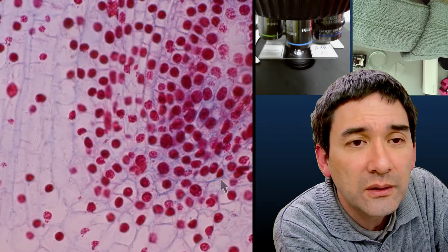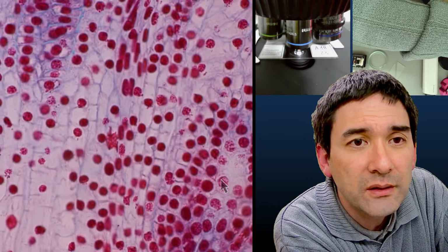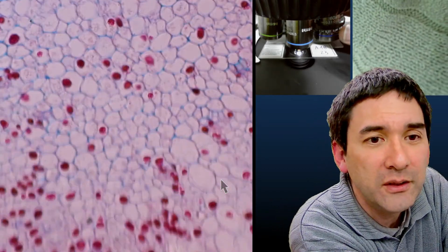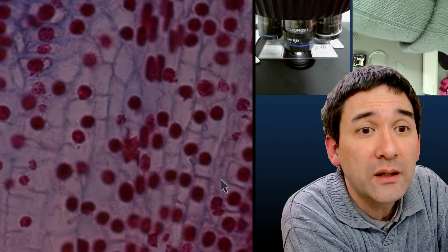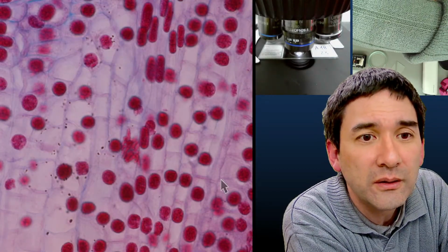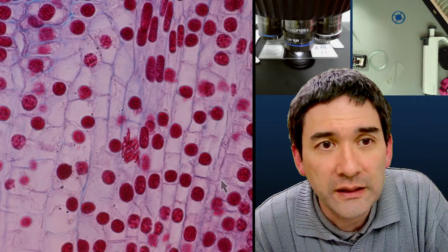So, where is it? Here it is. Oh, I bumped into my stage. Here, let's go up 60 times. So that's basically also a plant cross section of a lily.